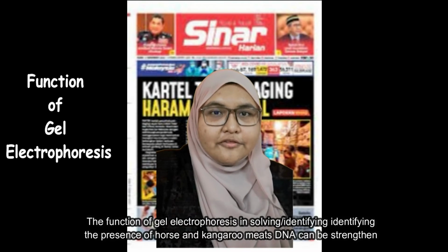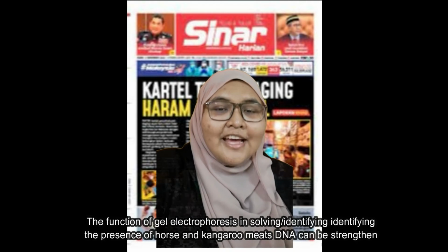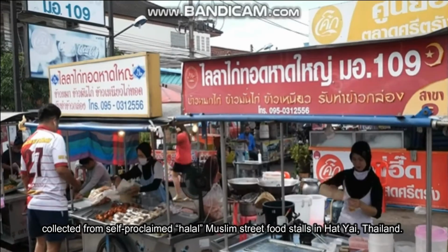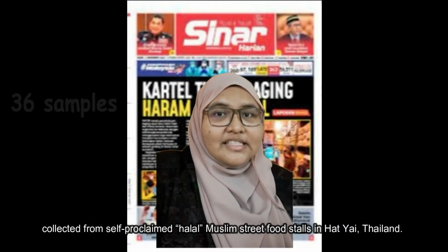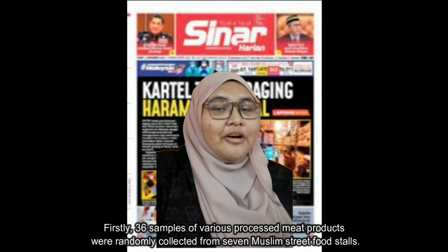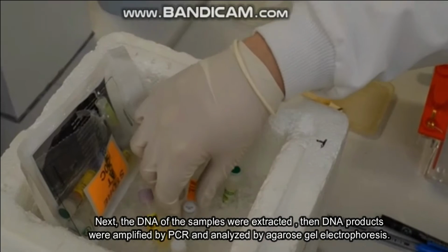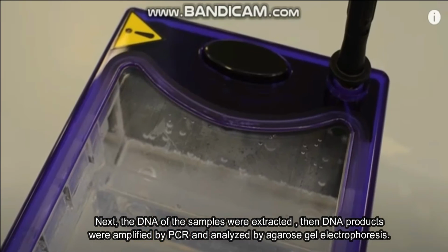The function of gel electrophoresis in identifying the presence of horse and kangaroo meat DNA can be strengthened by a case study that I read, which is the detection of pork DNA in processed meat products collected from self-proclaimed halal Muslim street food stalls in Hat Yai, Thailand. 36 samples of various processed meat products were randomly collected from 7 Muslim street food stalls. Next, the DNA of the samples was extracted. Then the DNA products were amplified by PCR and analyzed by agarose gel electrophoresis.